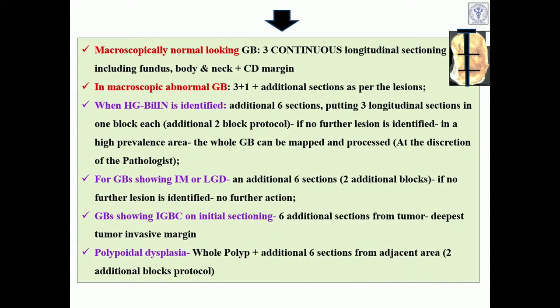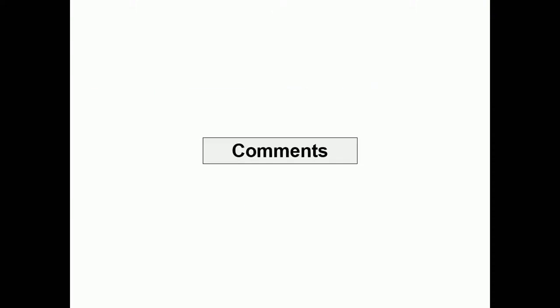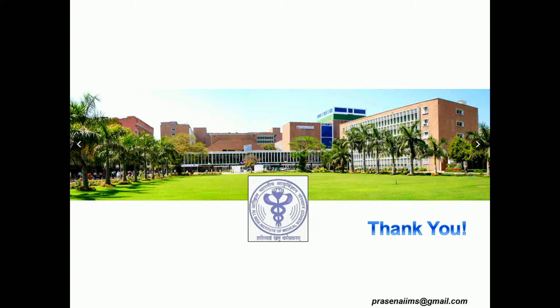For a gallbladder showing incidental gallbladder carcinoma on the initial section, 6 further sections must be taken. This is for accurate staging and identifying the deepest part of the tumor. And if there is polypoidal dysplasia, the whole polyp must be examined, and additional 6 sections from the adjacent area should be taken to see if there is any additional mucosal lesion in the adjacent area. So with that, I will leave it to the comments, and thank you so much for inviting me.